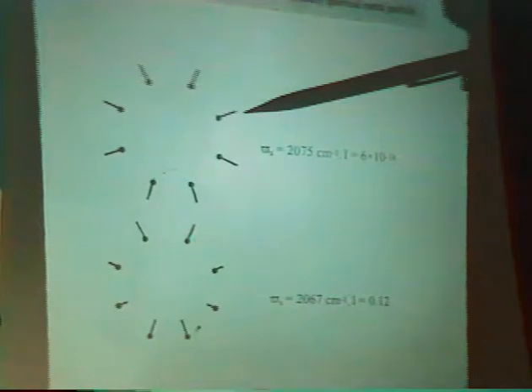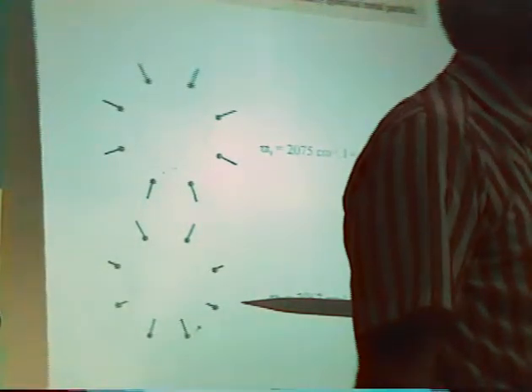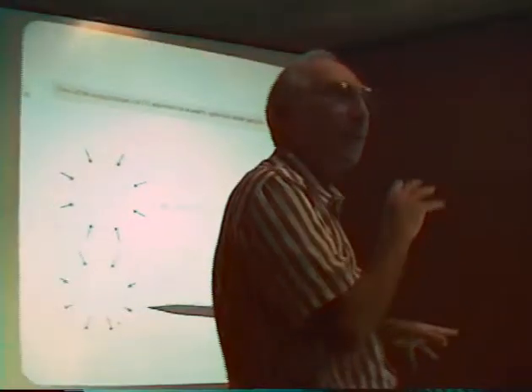And so in that case, you won't see that mode. The second mode, about 10 wave numbers down, is this one where the ones on top are stretching, the ones on the bottom are contracting, and it means they're all doing this together. And that's the mode where most of the intensity is. So sometimes you may have one mode oscillating and sometimes another mode, and the difference is about 10 wave numbers.